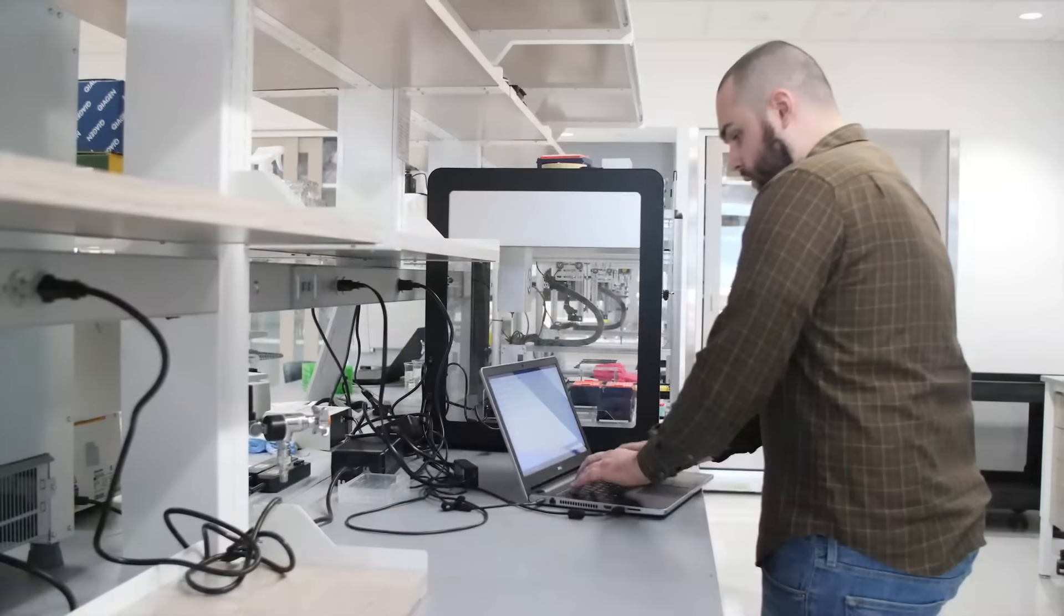Opentrons has set out to change lab automation by making the most affordable and easiest to use pipetting robot on the market. It's specifically designed for bench scientists like you.